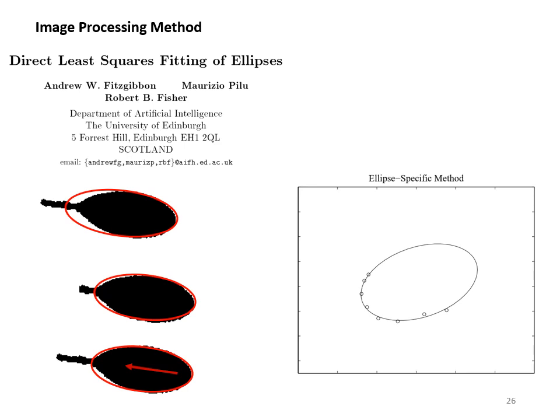And since we already had an ellipse fitted by region props, I was able to cut the tail and also find the direction of the tail and tell the algorithm to focus on the points that are on the other side, because the other side is the one where you have the nicer correspondence to an ellipse. And so as a result, you get a relatively better ellipse and also an arrow that points towards the tail that you can use for other purposes.